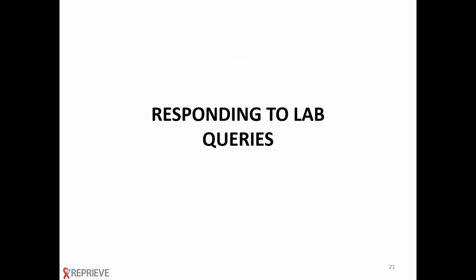Now we're joined today by Heather Springer, our Chief of the Laboratory Division here at Frontier Science, to discuss our lab query. So the lab query system that we have is a way to communicate with our labs to help solve our data discrepancies between the CRFs and the laboratory data entered into the LDMS.